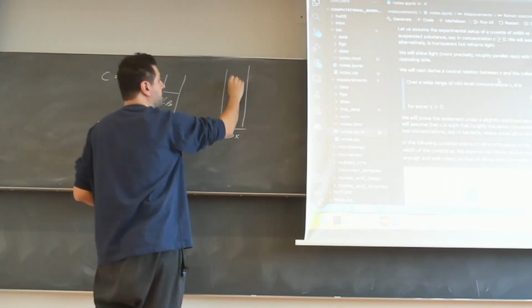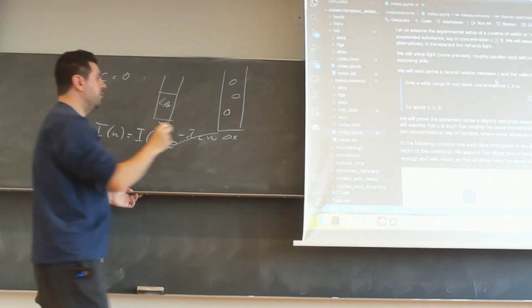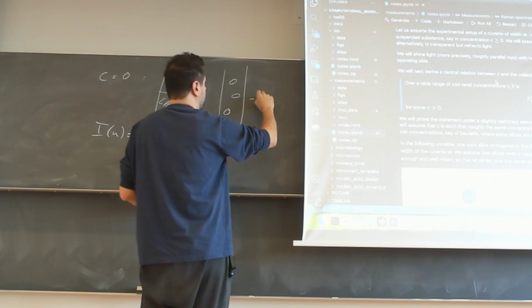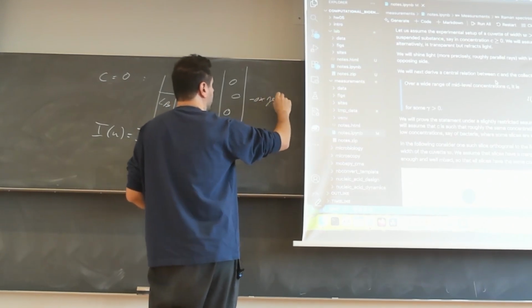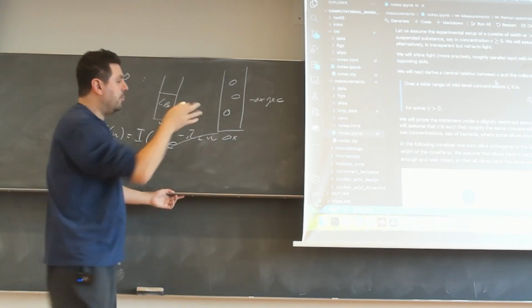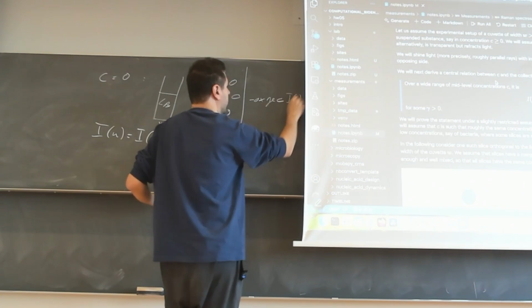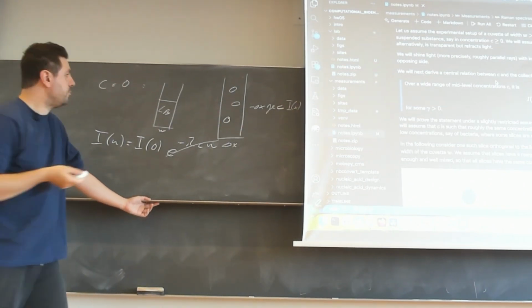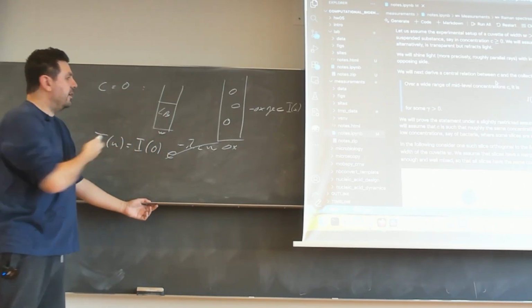Where we had, let's say, here were our E. coli, and they were blocking some light. So they were removing light of the amount minus delta x gamma and the concentration of the E. coli C times, of course, the incoming light. So it was proportional. That was the proportion they were removing. And now it seems that LB is kind of also removing.